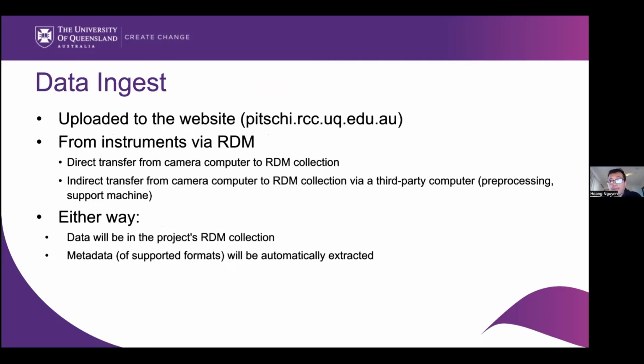Now, with data ingest, like Rubbiya said, Pitschi allows two ways for the data to be ingested. The user can go to the website and upload the data. This is suitable for small data sets.